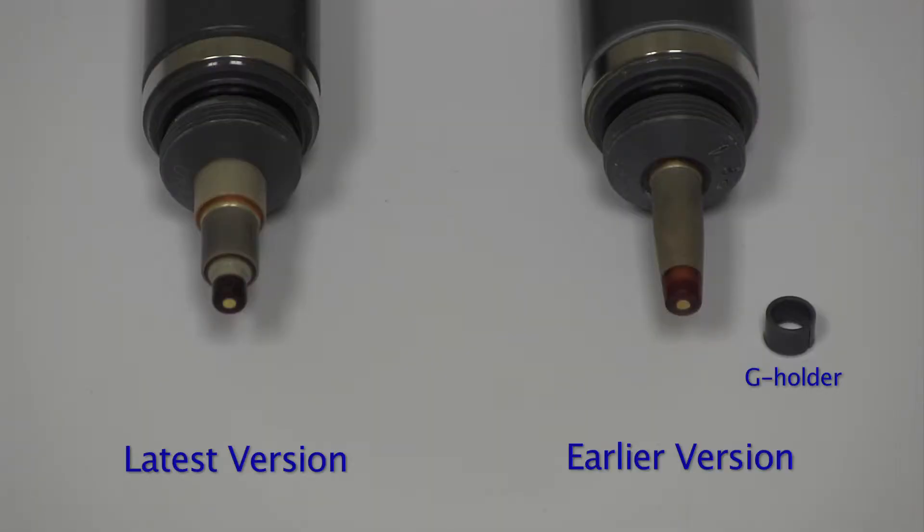For some earlier free chlorine probe models, an additional much smaller cap, referred to as a G-holder, was required and included in the kit.